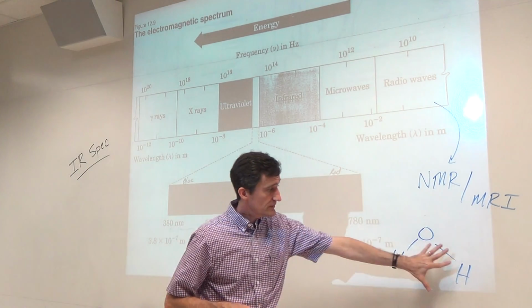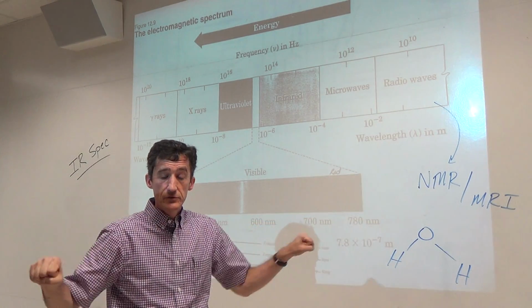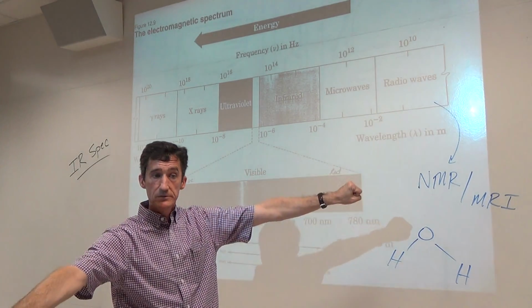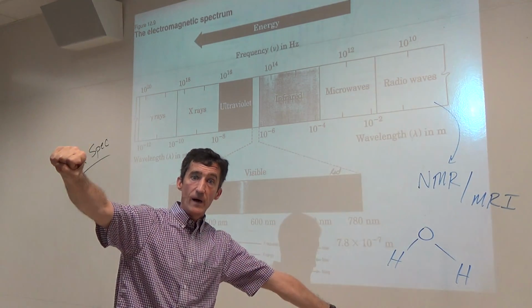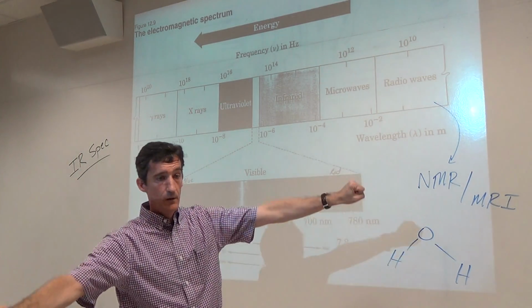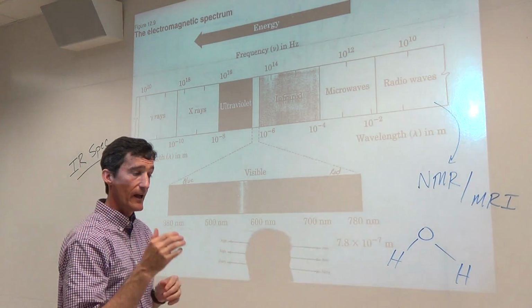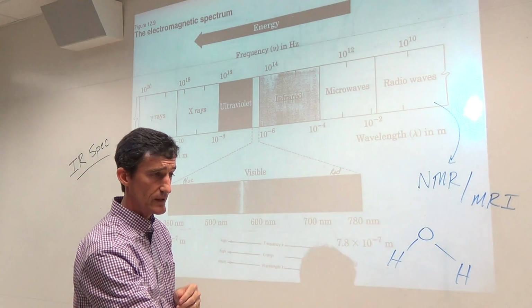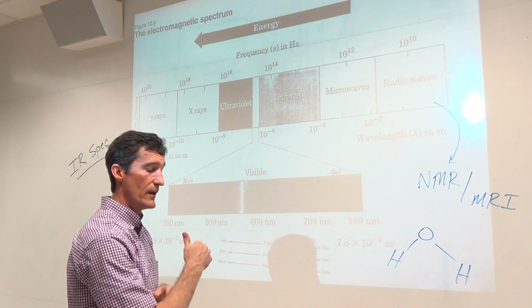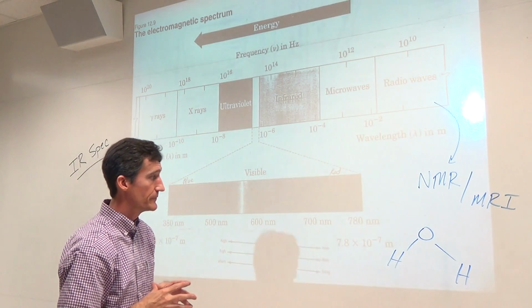What else can we have for something like this? If we stick with HOH, maybe instead of the bonds stretching, maybe we have something like this. The bond is not stretching. That's called maybe a wag or a bend. It could do this slowly, or maybe it's doing it fast. And you just have to remember, for every frequency that the compound is exhibiting from the vibrations, the IR light can match that, and an absorbance will take place.